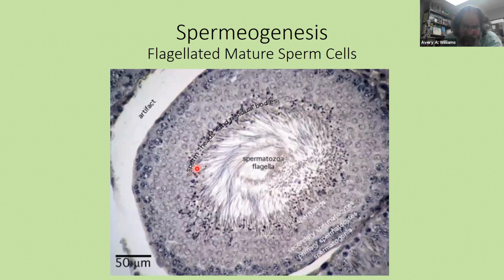And I think it says sperm heads and something. What does that say? Residual bodies? I'm sorry, I don't know what that says. Anyway, the heads of the sperm are tucked away right here, and the tails are swirling down the lumen.